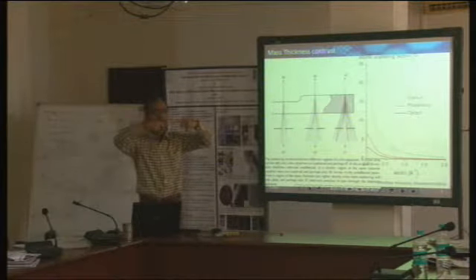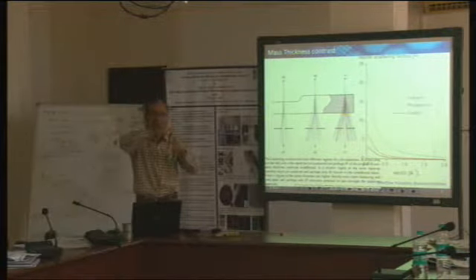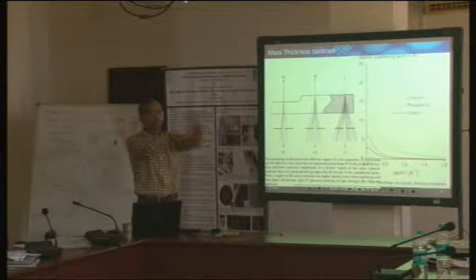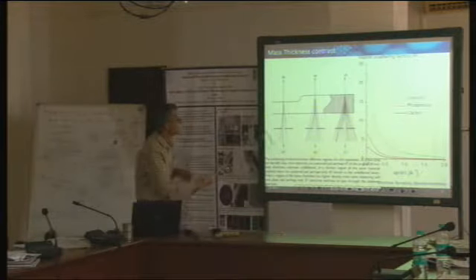So there is a gap between them, or there is a strip in which there is a hole. When I put that strip inside, the electrons will be allowed to pass through only the hole, and the rest of them will be blocked. So that is what this aperture is.